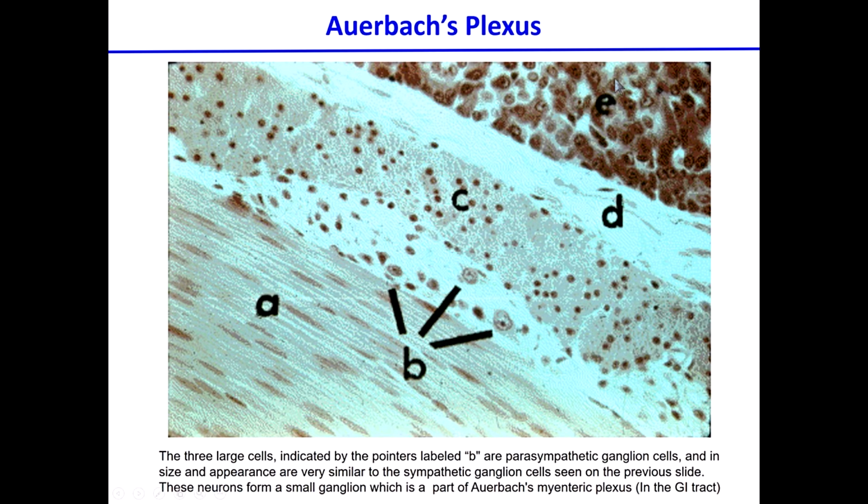This is one of those specialized structures that I mentioned earlier that is included in the category of nerve endings. This is how the nerve goes into the particular organ. This slide is taken from the GI tract, okay? And this structure, Dr. Auerbach determined that this had to have his name. So this is the so-called Auerbach's plexus, and you can find this is the nerve ending.